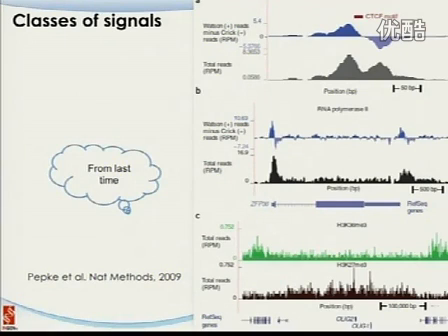But for the second part, there's RNA polymerase II. So you can see there's a gene expression. This is a transcription starting site. And around the promoter region, you will see this nice peak. And then after that, there will be transcript regions, and you can still see reasonable enrichment. And then by the end, the Pol2 pausing and eventually getting off from there. And for the third part, which is epigenetic markers, as you can see, this is a longer range. There could be several thousand base pairs, and you see gradually enriched signals along there.